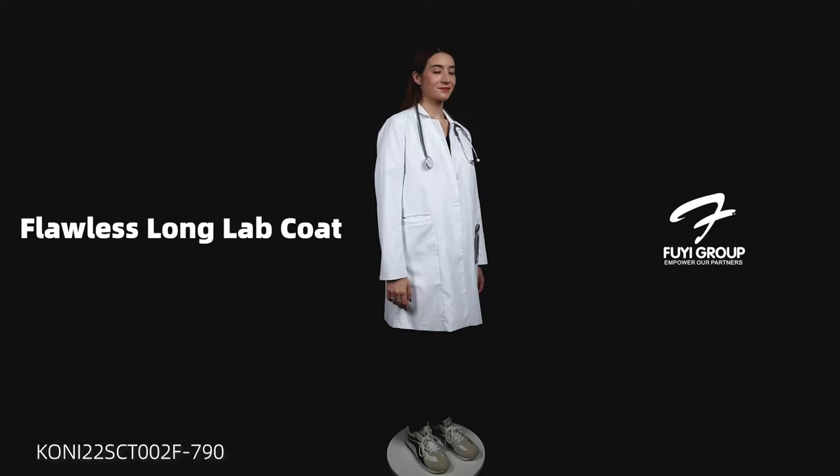This lab coat is very, very stylish and it's a very popular lab coat. If you're interested, you can get in touch with our sales team.